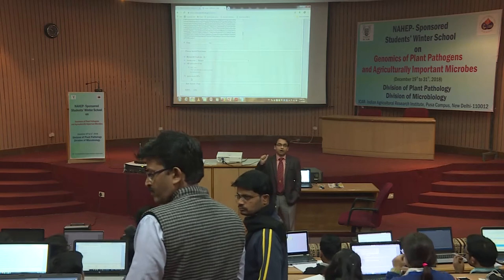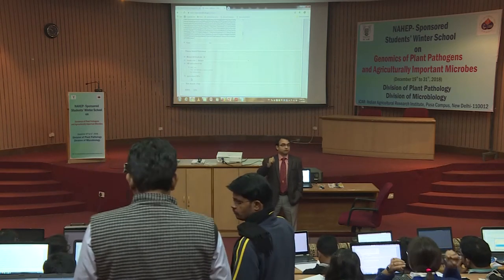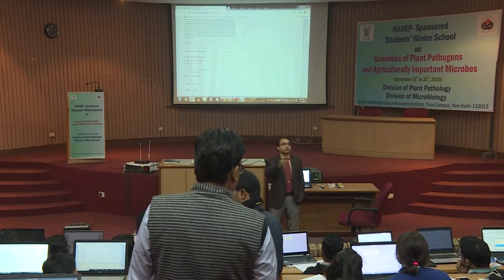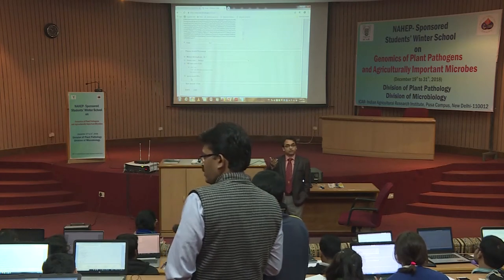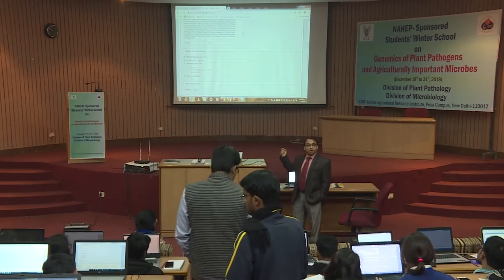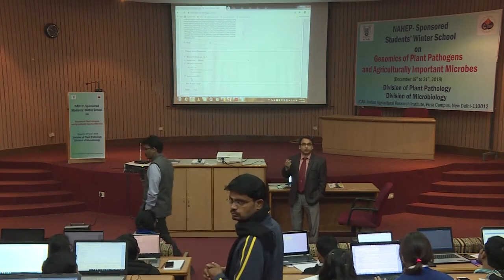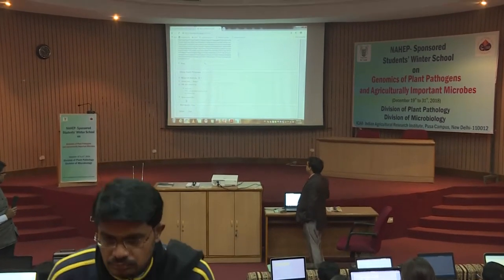Because, you know, for mitochondria and chloroplast, if you want to characterize your pathogen using those particular sequences, their codon bias and codon utilization are different. So for that you have to choose the organism-specific or organelle-specific codons which they are using. Otherwise, you use the standard.